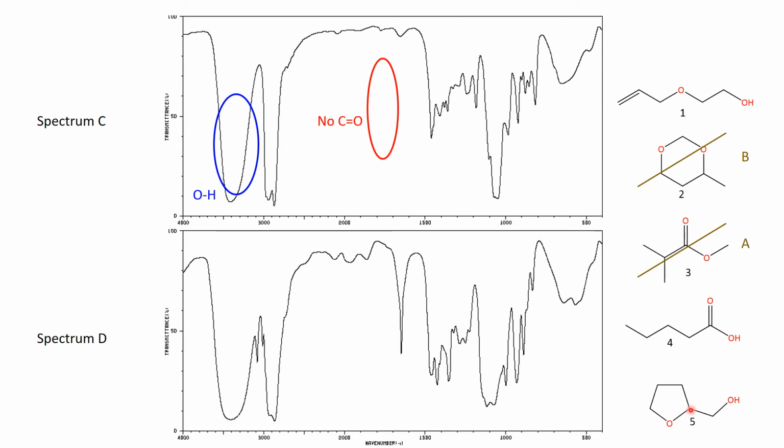Okay, well the one thing that we can look for as far as carbon-carbon bonds are associated in the infrared spectrum is carbon-carbon double bonds and carbon-carbon triple bonds. The carbon-carbon double bonds occur in this sort of carbon double bond to something region, and carbon-carbon triple bonds would occur up here in the carbon triple bond something region.